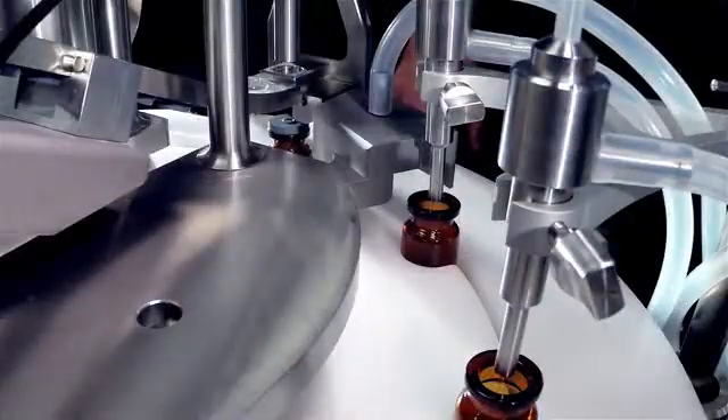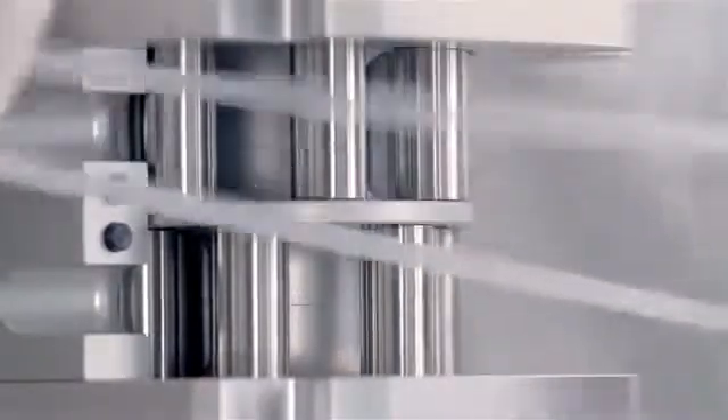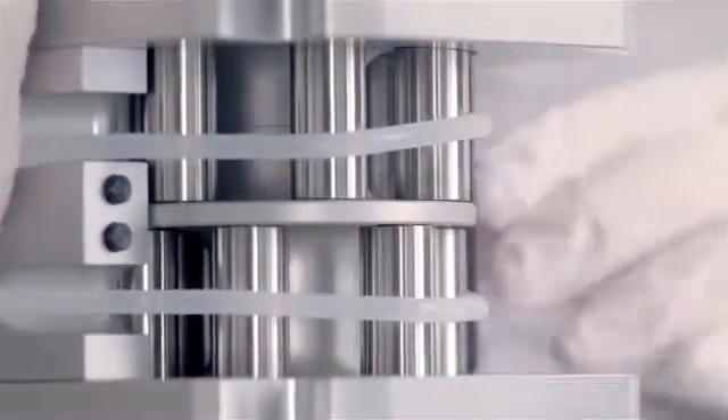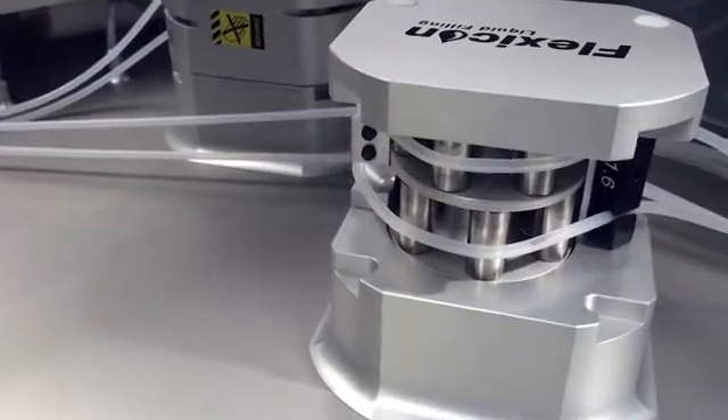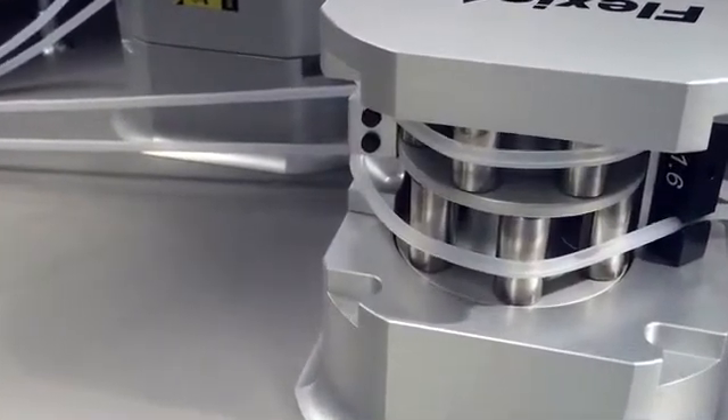Peristaltic fillers prevent costly overfilling on volumes from less than 0.2mL to 100mL. Liquid only contacts a single-use fluid path, so a changeover from one liquid to another can be done quickly without the risk of cross-contamination.